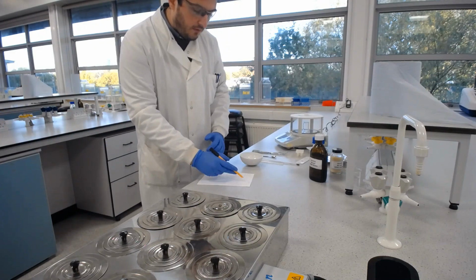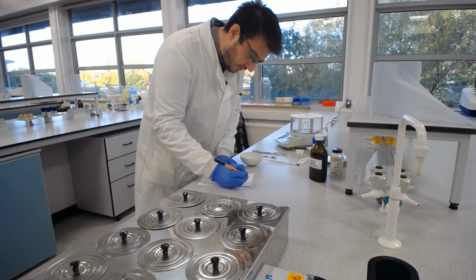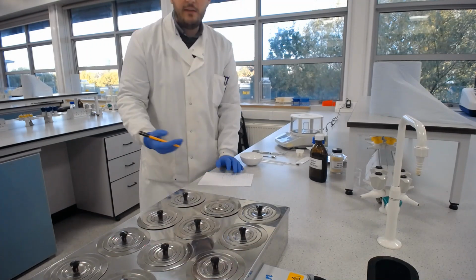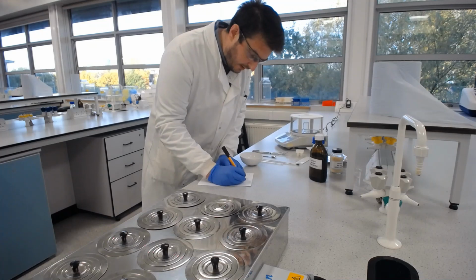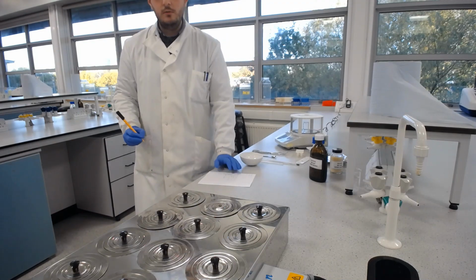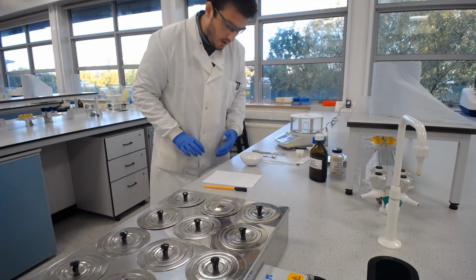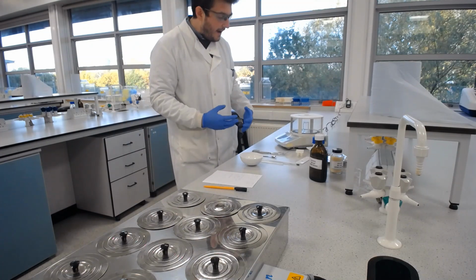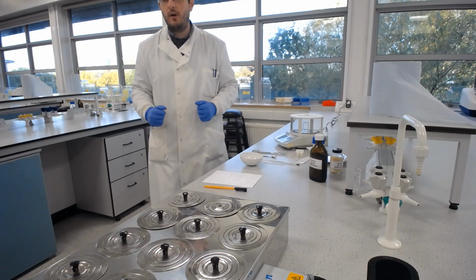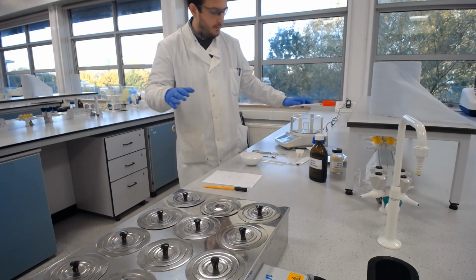So I've got 20.537 grams, and I know that I want to have 1.4 grams of gelatin and 1.6 grams of water. So that adds up to 3 grams. So essentially I'm looking for 23.537 grams in total with my gelatin and then my final volume of water later on. So what I'm going to do next is put an excess of water into there. I'm going to put around 4 to 5 grams, not 45, of water in there, and then get that on the water bath to be heating up.